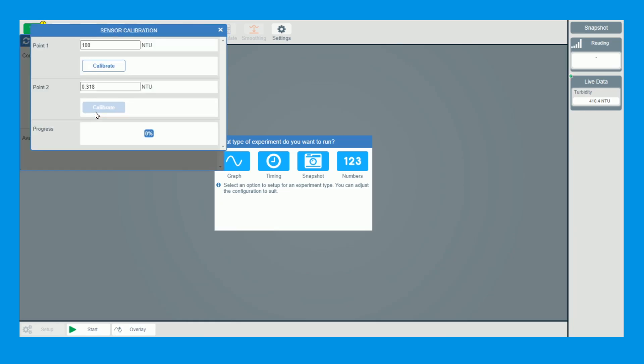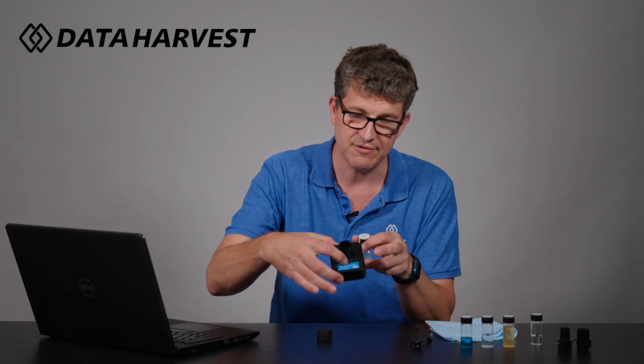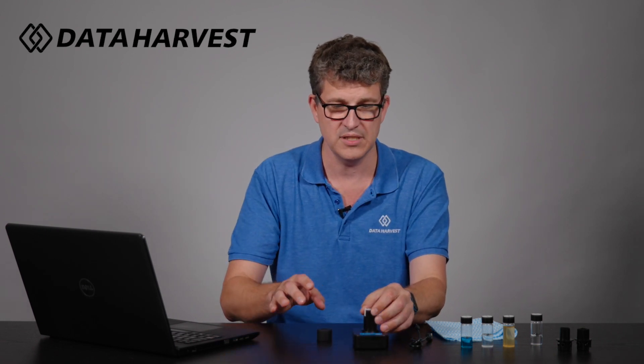I'm going to click on Calibrate. It tells you at the top that you need your 100 NTU sample. There are arrows on the sample and an arrow on the label as well — the arrows need to be pointed towards each other. All this information is in the worksheets and in the manual, so I'm sure you will be following the worksheets; they will guide you accordingly.